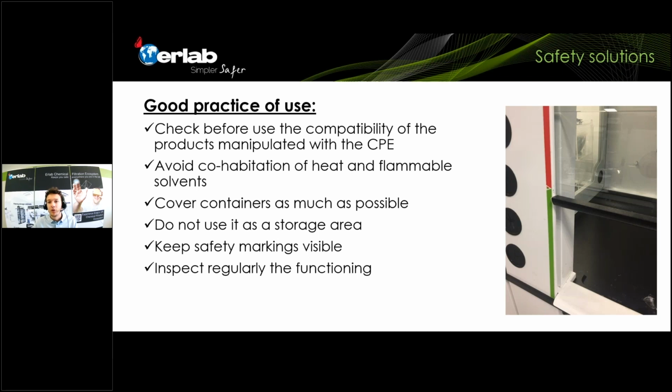Do not use it as a storage area. If we talk about ducted fume hoods or ductless fume hoods, never use a fume hood as a storage solution. Of course, in a ductless fume hood, you will saturate the filters, and in a ducted fume hood, it will consume a lot of energy. So always store products in a ventilated storage cabinet. And of course, very logical, keep safety markings visible and regularly inspect the functioning.